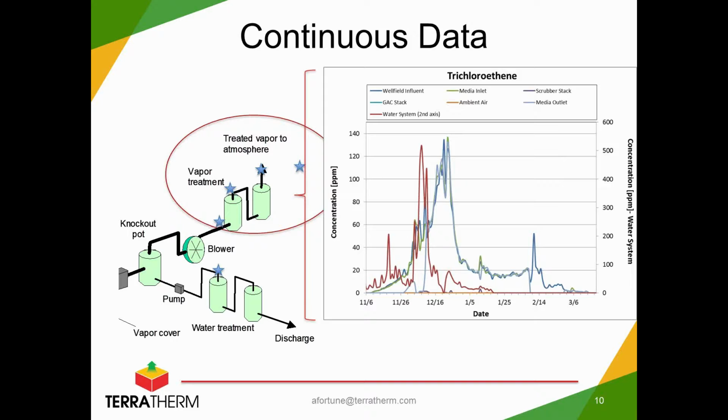So we were able to, at any point in time, go in and look at what the concentrations were at one given time, and what the trends had been over the past period of whatever duration, a few weeks or months, in real time. The resolution of having this type of real-time information definitely proved to be an advantage, which I'll talk about later, as opposed to somebody collecting individual grab samples.